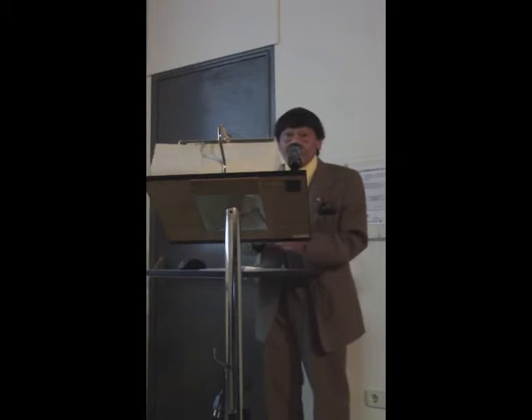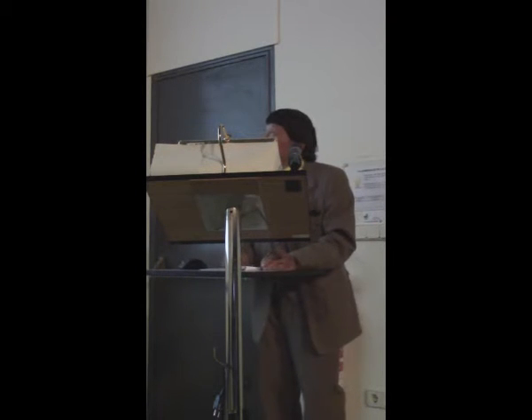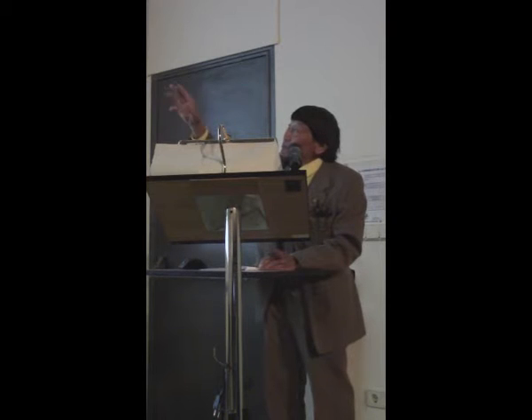We did a lot of work. We drove around the countryside, beaches and all over the place. So we did this Fung method and counted the quantities versus the extrapolation data, versus the EC phage extrapolation data. And they came out very, very comparable. If there's no organism in the Fung data, we have no phage there, etc.